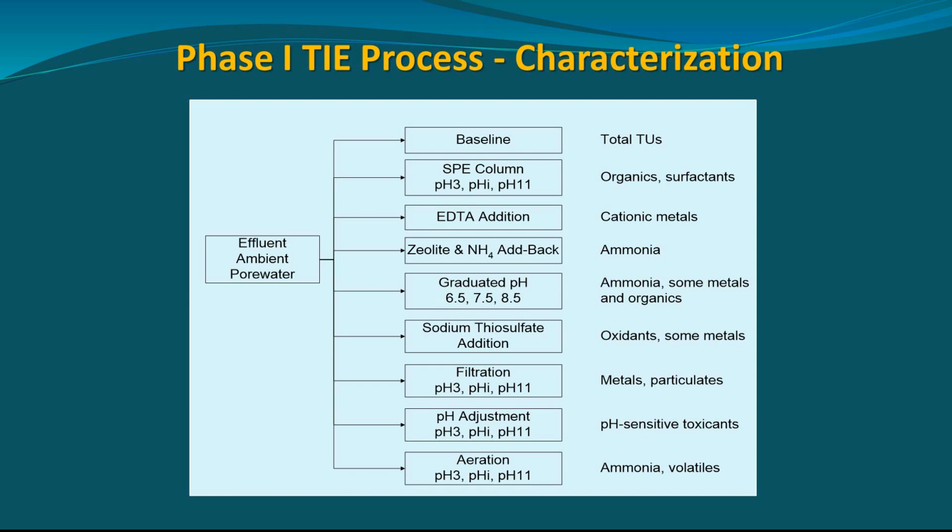We've seen this before where we have a sample. I can think of San Francisco Bay, right there at China Basin where the ballpark is. There's a combined sewage discharge that leads into that channel right there. And it's loaded with organic matter from stormwater discharges. It's really high in ammonia, but it also has organic contaminants in that sample too. So the first thing we have to do is blow off the ammonia through aeration or through manipulating the pH to eliminate that as a toxicant, and then we can do TIEs on what's left over, the organic constituents.